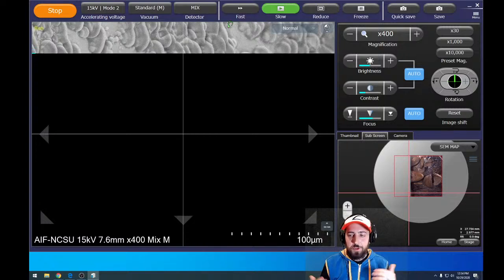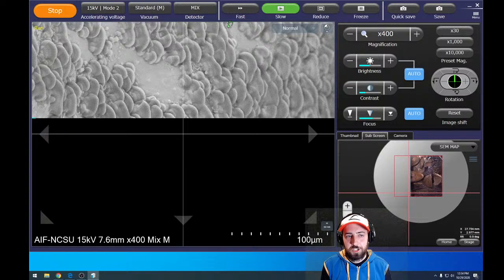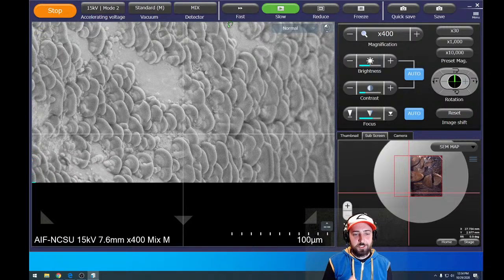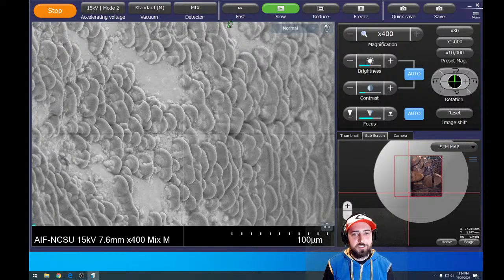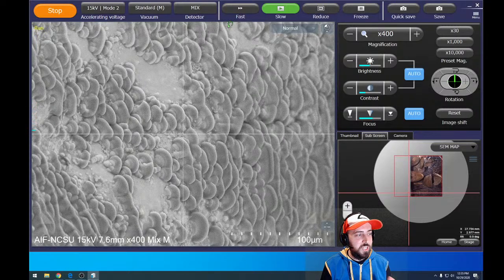So with all of these samples, and we may have talked about this quite a long time ago, I have to coat them with something conductive to actually get an image out of them in an electron microscope. Basically the electron microscope works on the basis of how electricity works, it's the transfer of electrons. So we're shooting electrons at a sample, and we're ejecting electrons from that sample, and we're counting them as they come off. And the more conductive to electricity a material is, the easier it is to image with an electron microscope. So if something is not conductive, if it's insulating, it wants to hold on to electrons, then we have to make it conductive somehow.